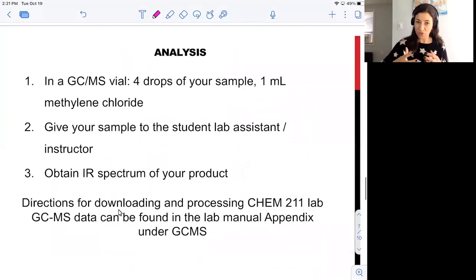So once you have this oil, we want to find out what's inside of it. You can obtain a GCMS vial, which is a tiny glass vial, and you're only going to add a couple of drops of your sample using a pipette tip. Even two drops is usually sufficient. Our instrument is very sensitive, so we don't need a lot of material. You're going to add one to two milliliters of methylene chloride to that vial and give it to your instructor or the lab assistant. This sample will be analyzed overnight, and you will be given instructions to access your data once it's ready.